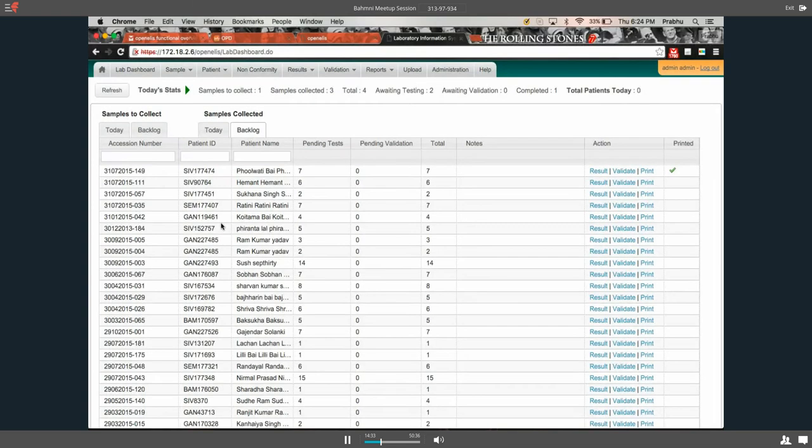So do you have a way of breaking this down?